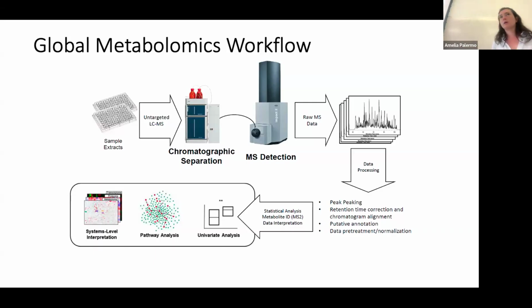However, there is also another very important aspect that is informative in metabolite identification. Depending on the affinity of our analytes for the stationary phase and mobile phase, while they run in the chromatographic run they can be more or less retained. That informs us on the nature of that metabolite, right?